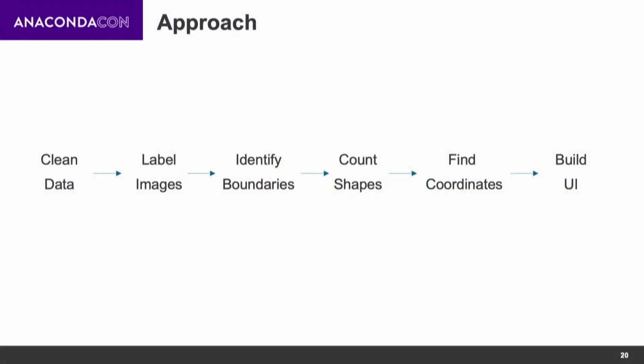And then all of the images which come after this stage are put through the counting model. So now you can see that the counting model starts picking the cleaned image, splits it into the same 3x3 patches. You have 9 patches, and each patch goes through these 2 stages: a high-level prior to do this approximation, classification into one of 5 or 10 buckets, and the second stage, which does the density estimation, the Gaussian density estimation. So similar to the approach we had used earlier. And with this pre-processing, it started giving us results.